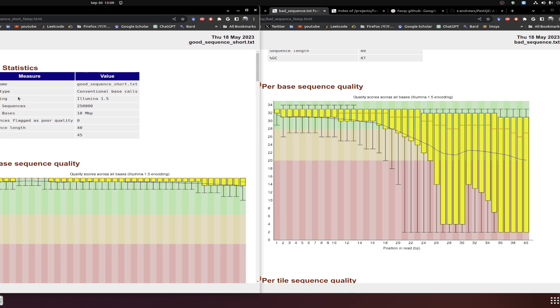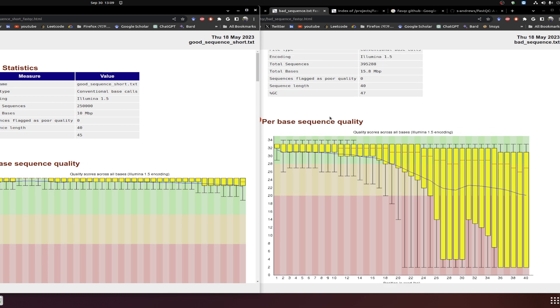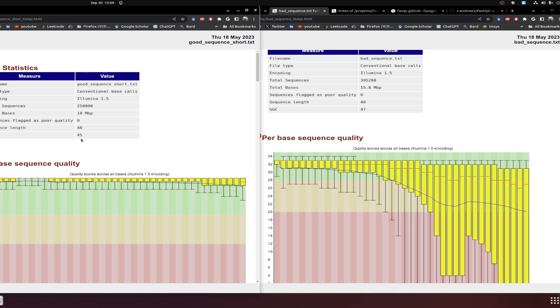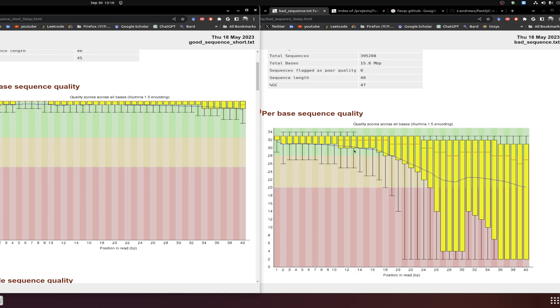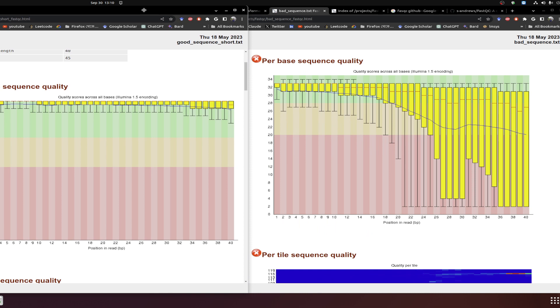Placing the two examples side by side, you can see the basic statistics including percentage GC content and total sequences. The second module is per-base sequence quality. When comparing the good sequence dataset versus the bad one, you can clearly see differences in per-base sequence quality between them.